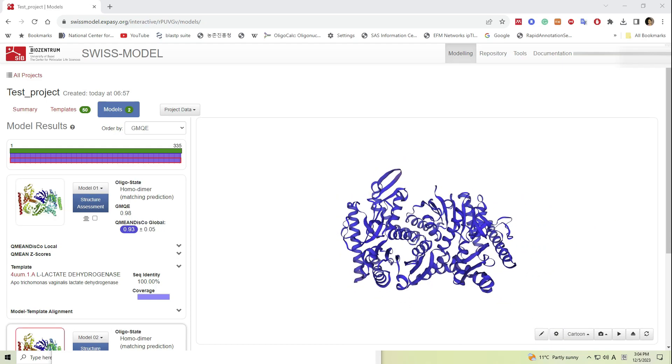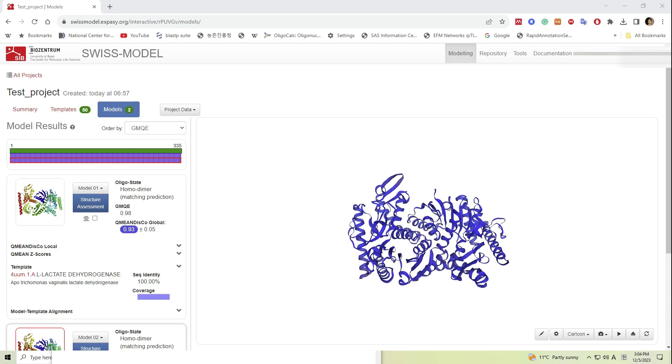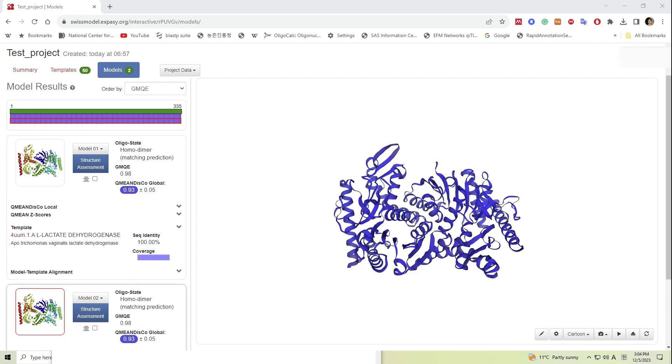Two models have been constructed and the color is an indication of the confidence of the model. Blue color indicates better confidence.